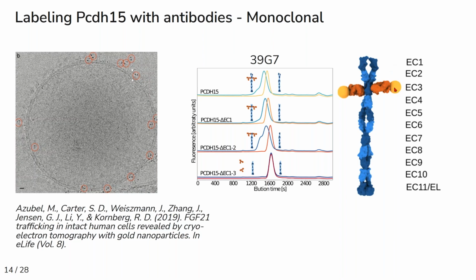So we were hoping that by synthesizing these reagents, we would basically get images like this. And after a few tries, we were very excited to see... I'm not sure why this picture is not loading. I mean, I had a micrograph here, but you also can see here that on single particle images, we could precisely see density that looked like this.